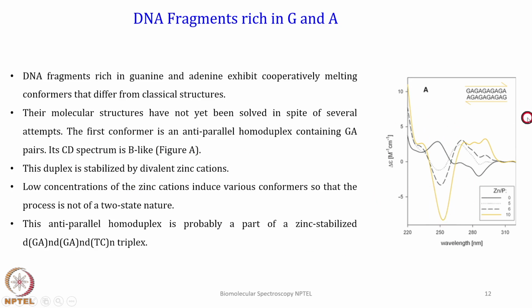You see a CD spectrum like this, right. Here, with 0 zinc and protonation, a lower concentration of zinc cation induces various conformations.